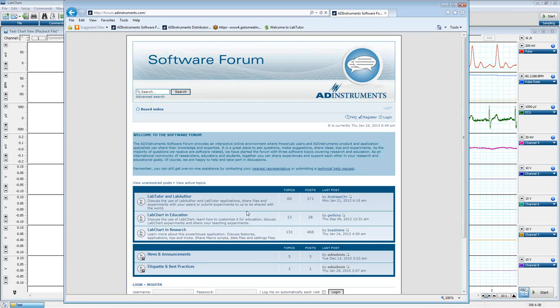I will answer some of these, so will David here in the U.S., but people all over the world answer these questions, including our developers and programmers. So this is a great way to get answers to your specific macro questions. Of course, you can always just ask me or David, but in a case like this with Excel, where things might be a little bit over my head as far as the macros are concerned, this is another way for you to get information about that. Now, like I said, I believe you could do something like that with Excel, but I wouldn't know off the top of my head exactly how it can be done.